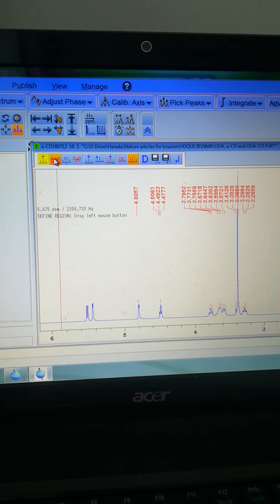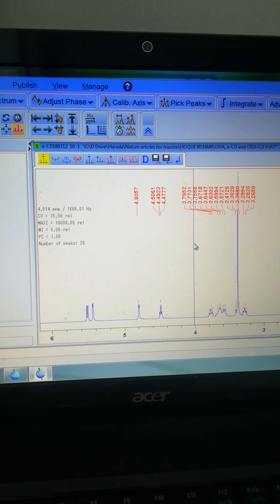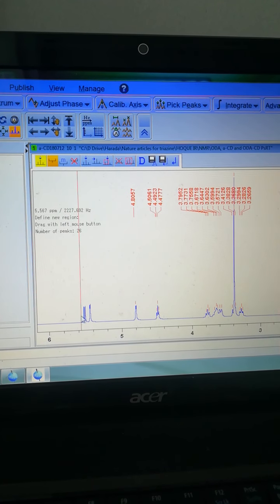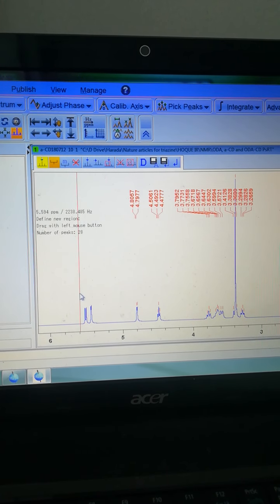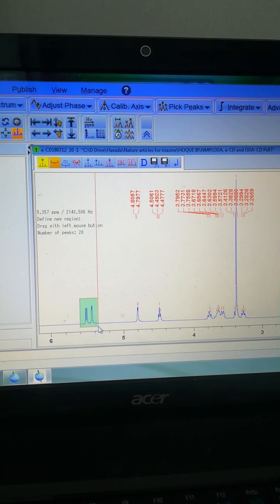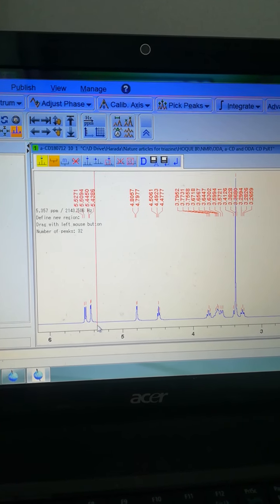So to do so, again, I have to withdraw the deleting region peak. Here you can now do peak picking of that region again. From here, the same way, you click your mouse and move, and here you can see the peaks appear again.